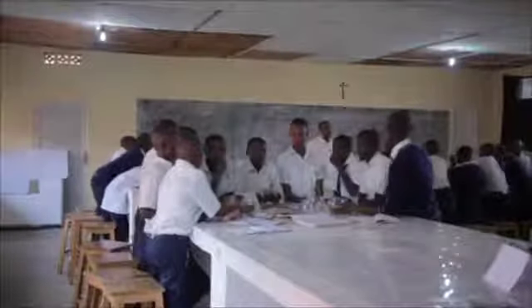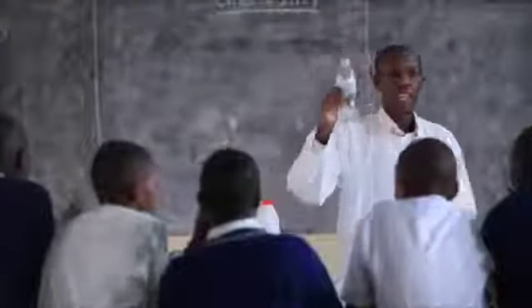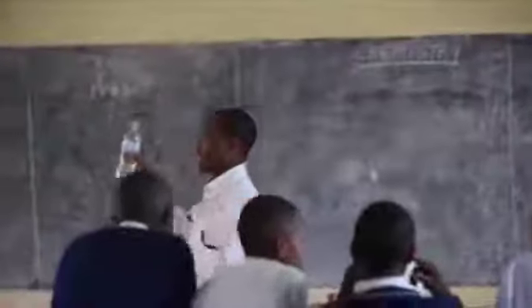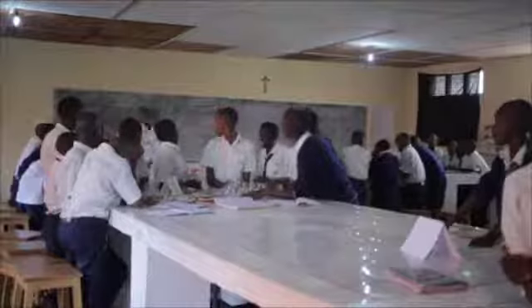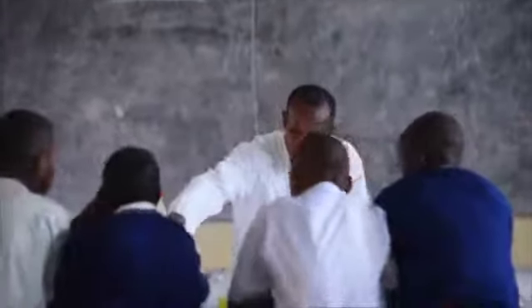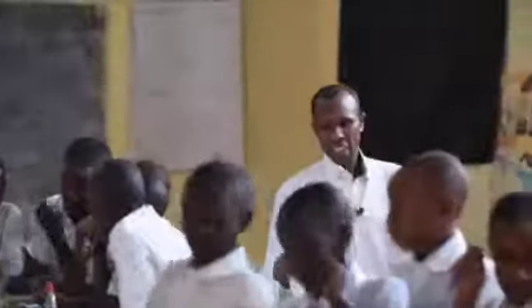Now you are going to observe very well what is going to take place if we mix ethanol and water. We are going to make the fourth mixture made of ethanol and water. We have to add water and observe. Try to shake that mixture. You have ethanol and water and shake.